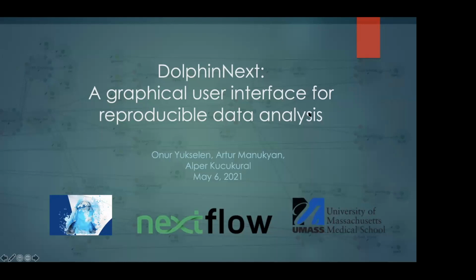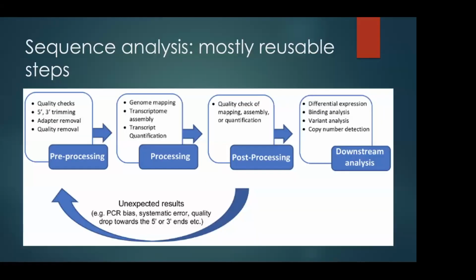Okay, so today I'm going to talk about DolphinNext. This is a graphical user interface for reproducible data analysis. So last couple of weeks we were talking about preparing the files and mapping them to genome and doing quantification on those files and some differential expression analysis.